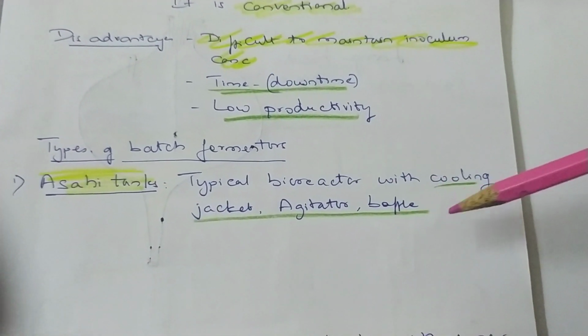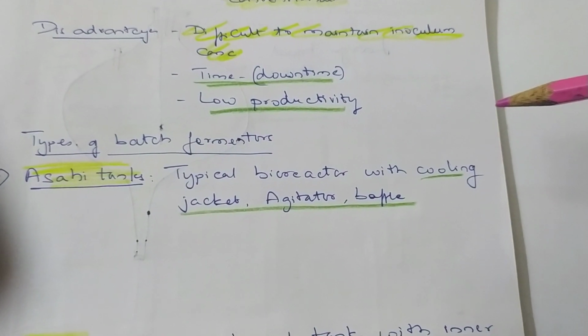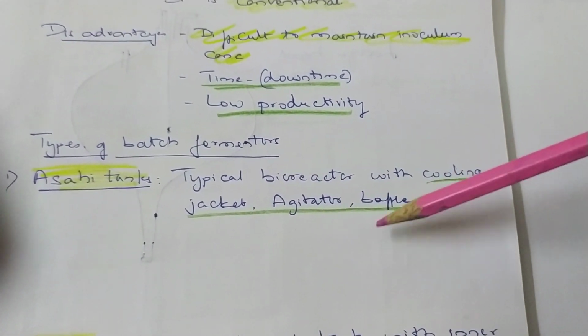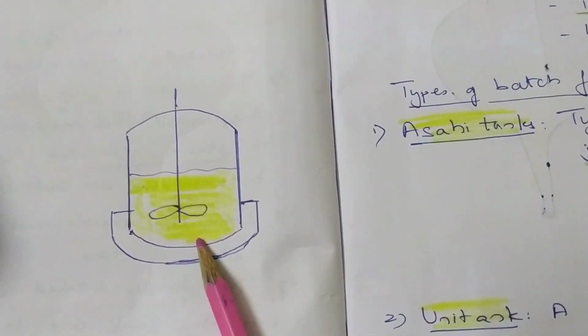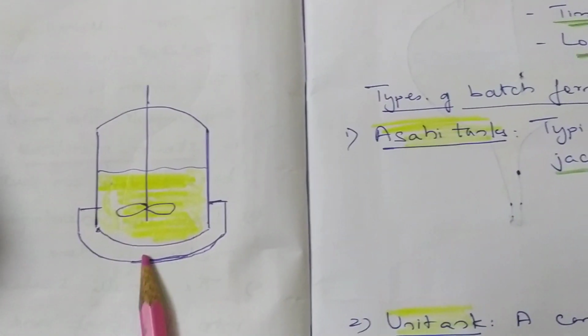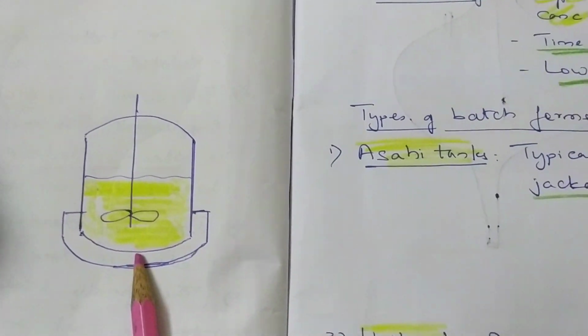Coming to one of the first ones, Asahi tanks. Asahi tanks is a typical bioreactor with cooling jackets and agitators and all like this. This is an Asahi tank, a very basic model of a bioreactor, which all of you are familiar with.